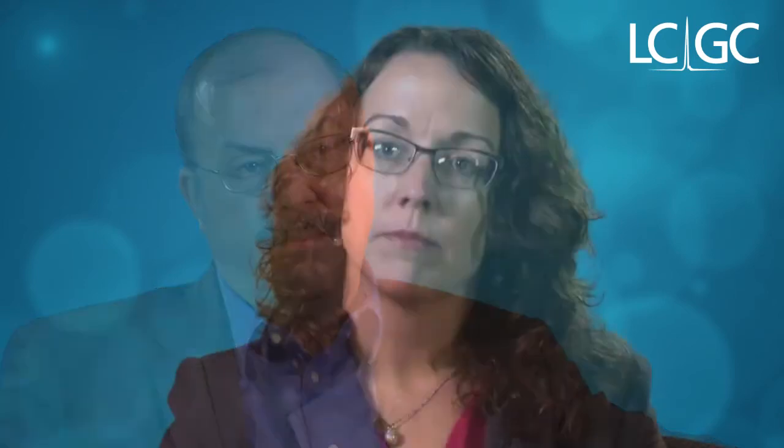What about the newer particles that have been developed specifically for protein analysis that are superficially porous but have larger pores? What kinds of results have you seen using those?